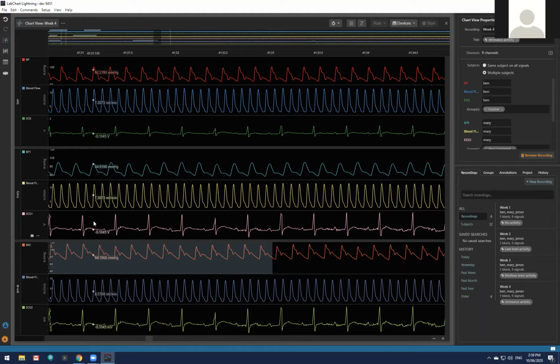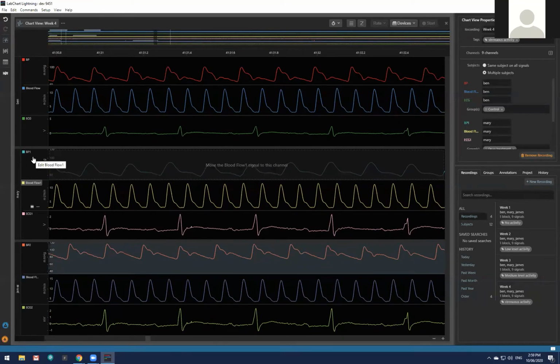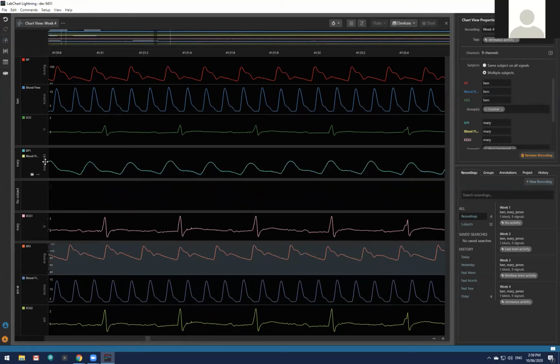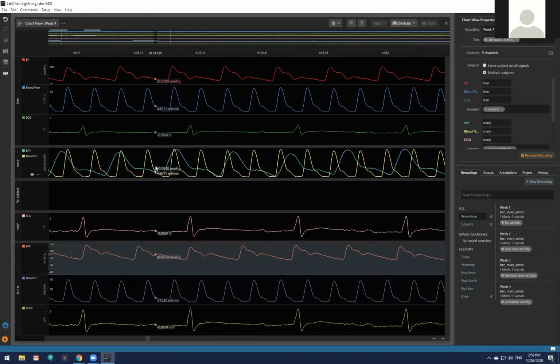So what are overlay signals? Let me get those definitions clear for you. A channel is what we see here, not the data, it's just that this is a channel. But the signal is the actual data itself. So what does that mean? What we can actually do is left click on our signal and drag it into a different channel. And if we double click like this, what we see now is that our data is overlaid.